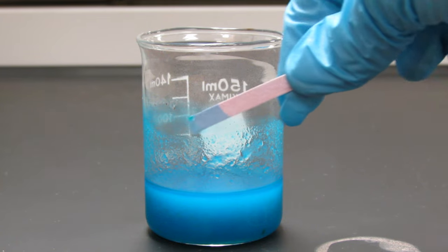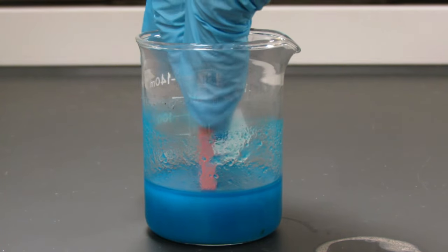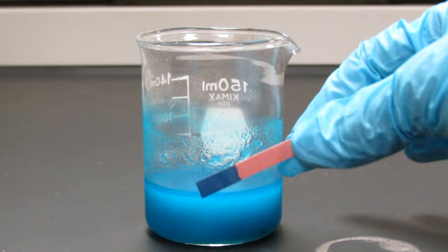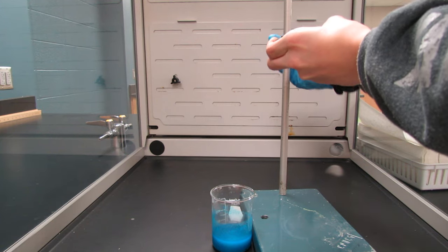Test this with red and blue litmus paper to make sure that it's basic. The blue litmus paper should stay blue, and the red litmus paper should turn blue, indicating we have a basic solution.